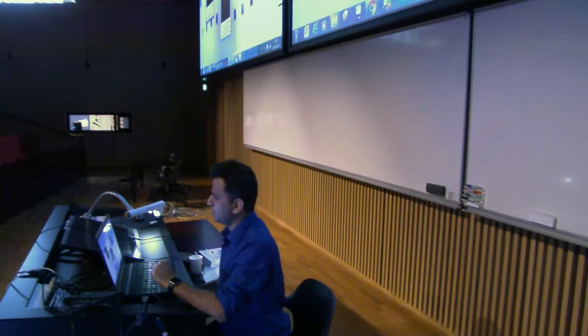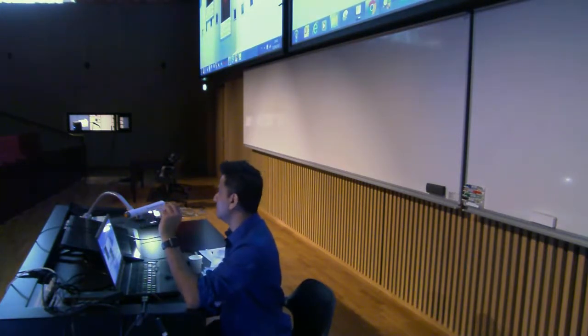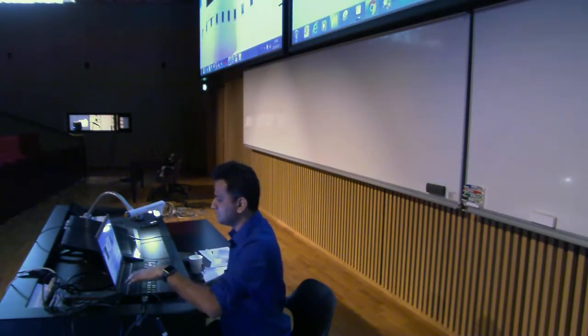Okay. What if I want to crop the data? This is also important, right? Maybe if you have a big time-lapse data and you do not want to spend time working on it, you can always crop the time points. So just close it, and then you can go to image, duplicate, and here you can control. You can say Fiji, I'm interested in only channel number 1, or maybe only the middle slice, which would be the third one, for example.